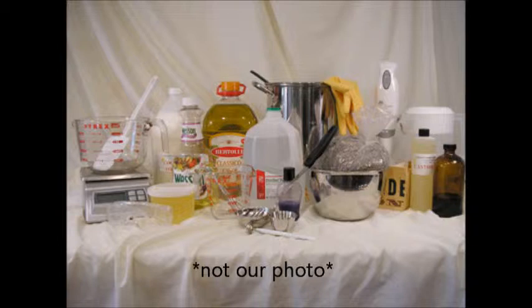mold, vinegar in case of a spill, a plastic pitcher, cardboard, towel, and a plastic opening spoon. And the ingredients are 4.6 ounces of lye, 9.9 ounces of distilled water, 2 ounces of sweet almond oil, 18 ounces of coconut oil, 10 ounces of olive oil, and about 1 ounce of peppermint essential oil.